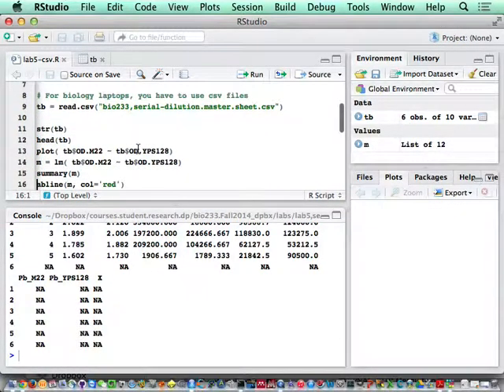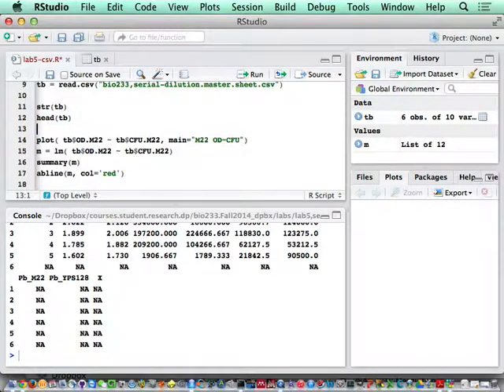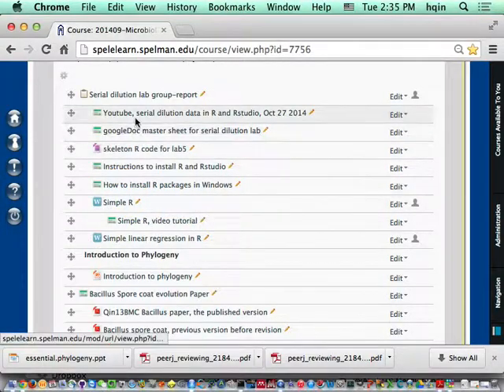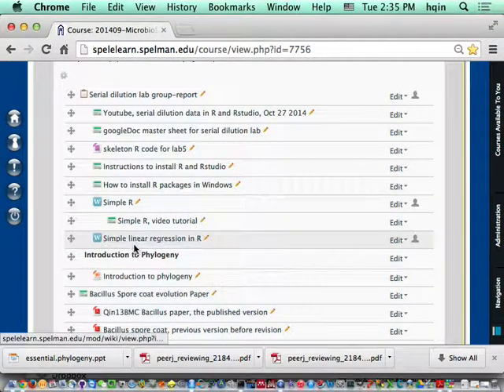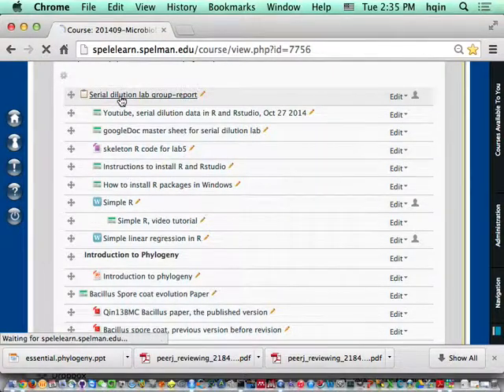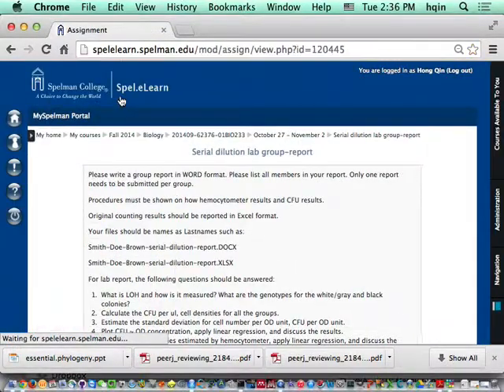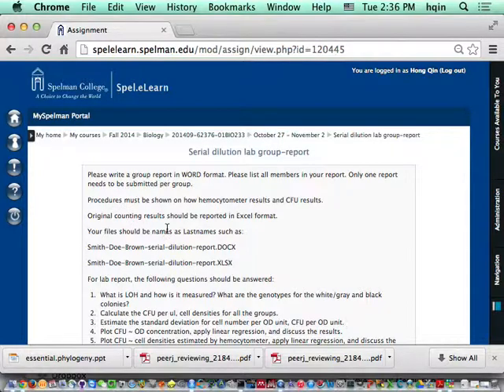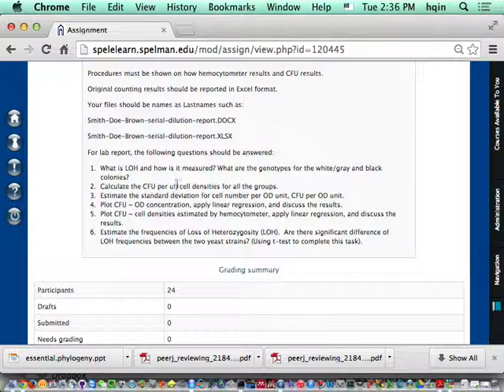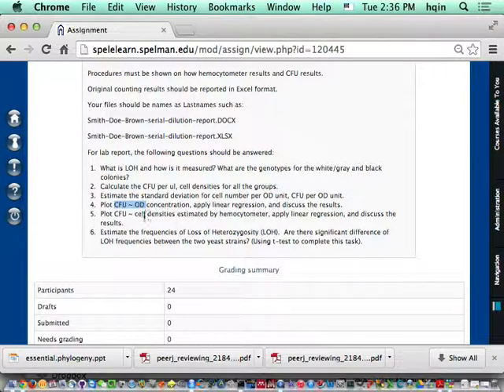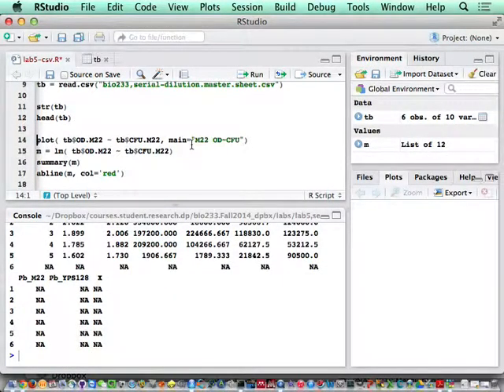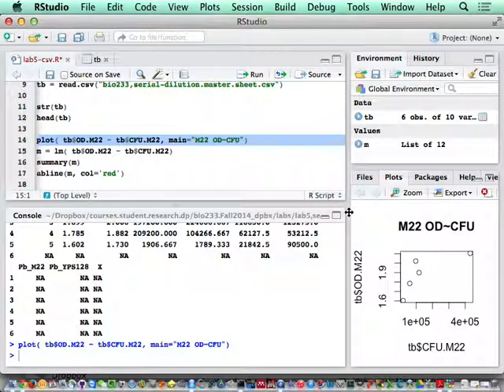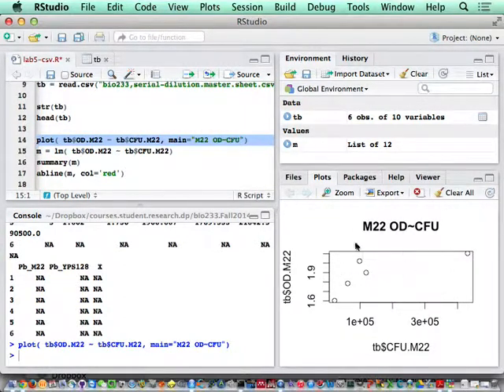One of the advantages of R is to plot and do numerical analysis. So let me see the lab report instruction. You need to explain what is LOH, calculate the CFU from your individual group result, then plot CFU over the OD, CFU over cell density or cell concentration. This will be the OD versus the CFU. We highlight that and then run, and you see the plot on the right panel. The result is reasonable, although it's not perfectly linear.